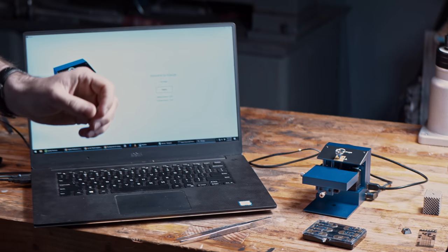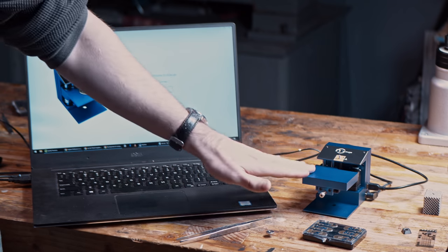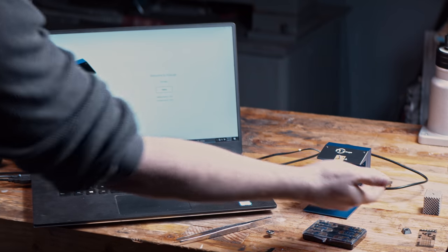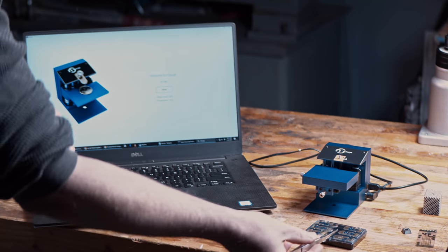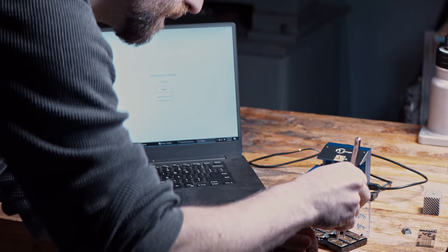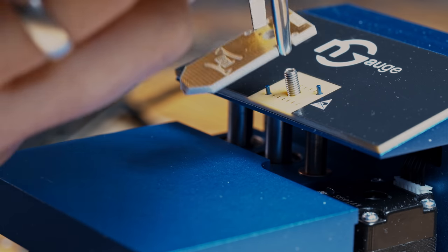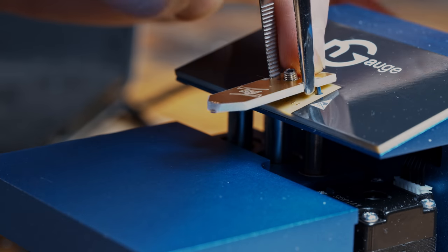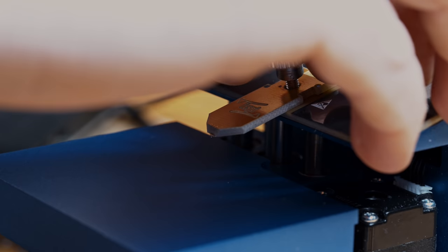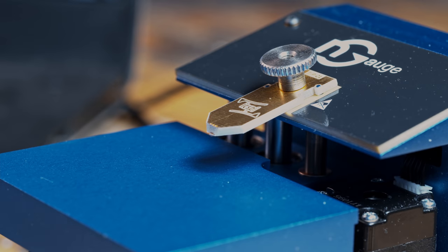Here is the N-gauge atomic force microscope. You've got a thumb screw here which mounts the chip. There's a stage with two micrometer thumb screws for adjustment, and a small stepper motor on the side which raises and lowers the stage. To use this, you pull one of the chips out of the case and mount it to the thumb screw. You want to be careful because the tip is very fragile.